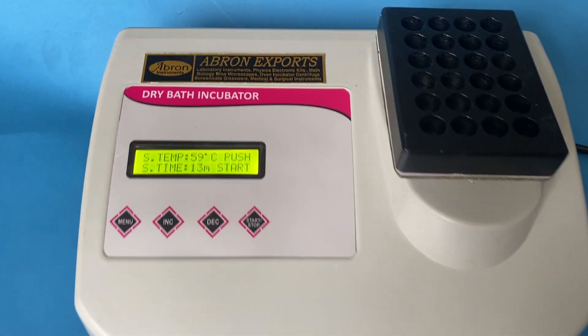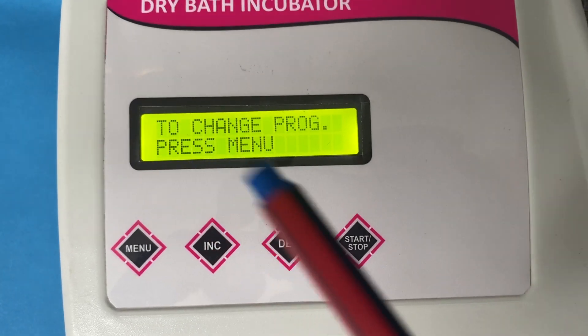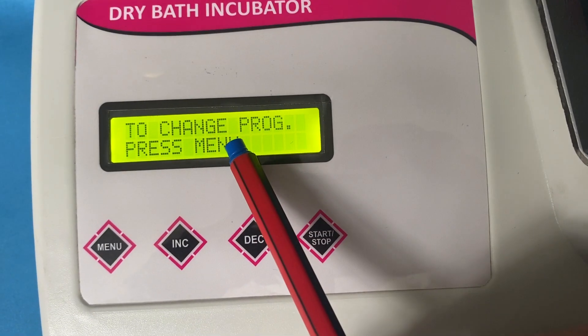This is a Dry Bath Incubator by AperonXport. There is the temperature — you can change the temperature and set it. This is the temperature set.